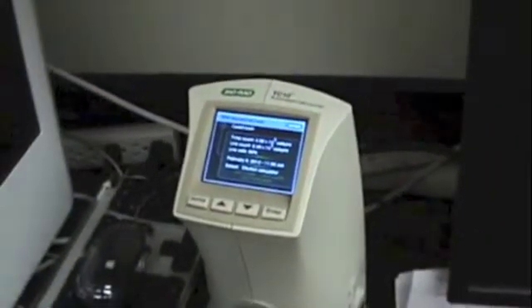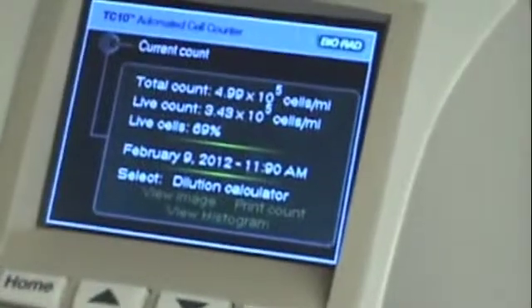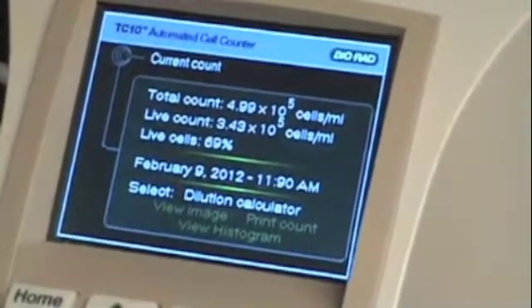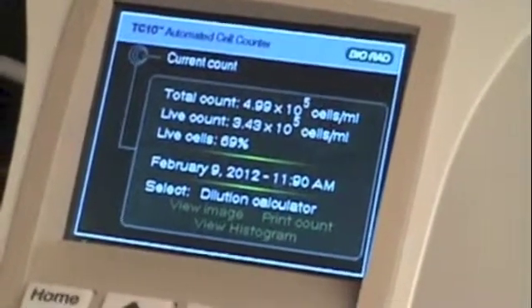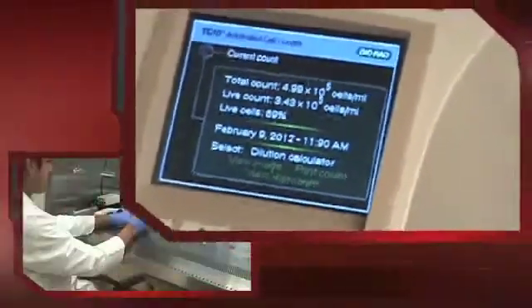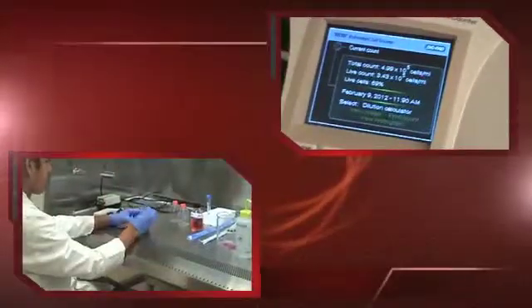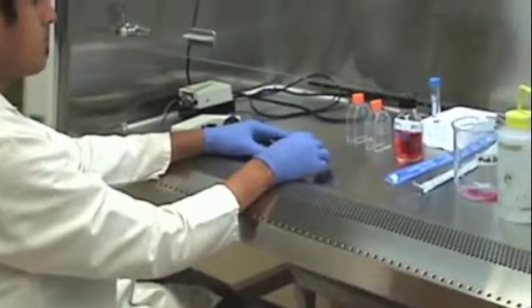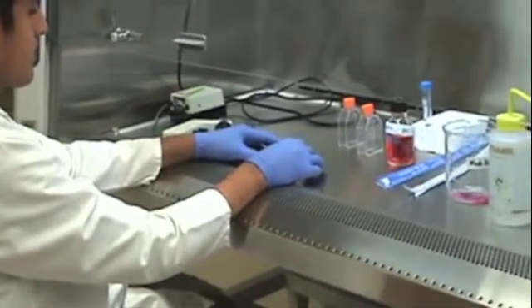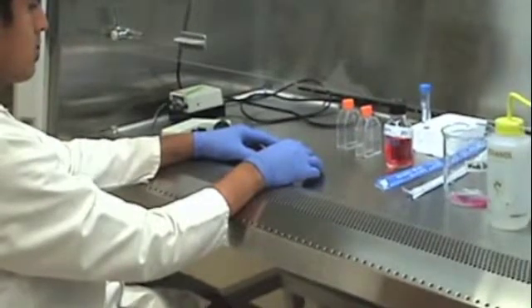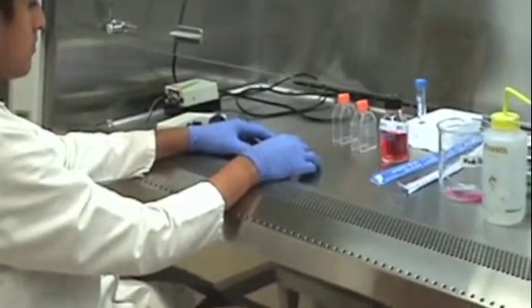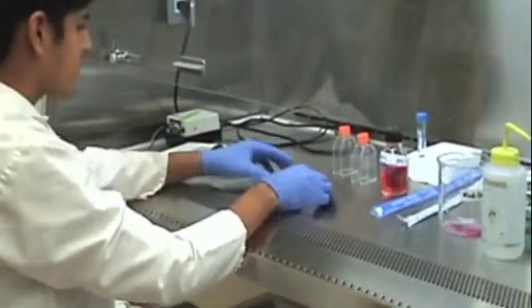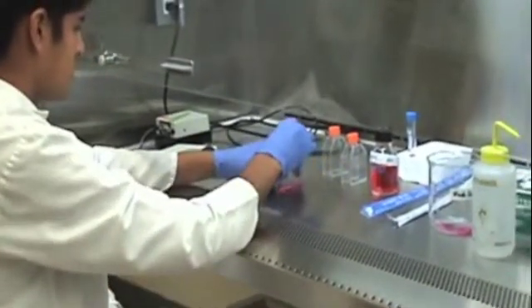The purpose of a cell count is to determine how many flasks you want to split your cells into. Our cell count shows that we need to split our cells into two flasks. We determined that in order to have an optimal density of cells per milliliter, we need to split into two flasks.